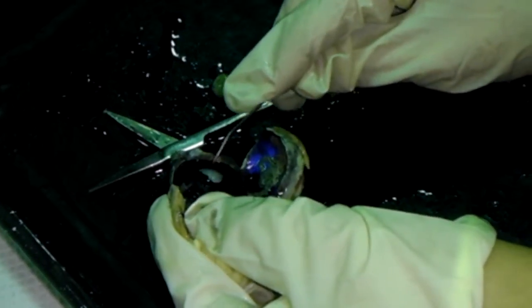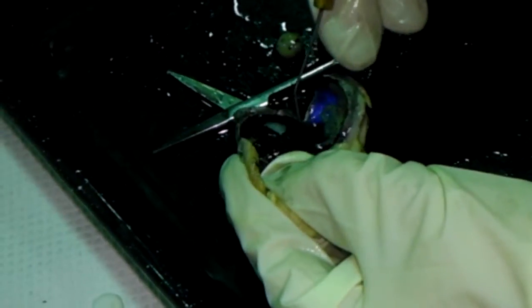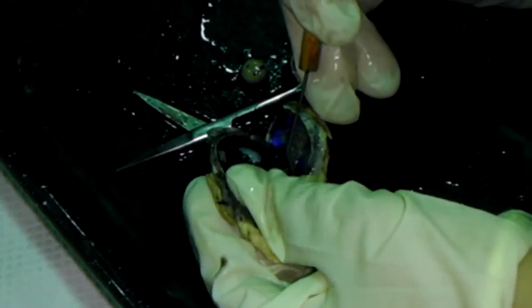And this is the opening that you have here inside. So this is the iris, guys. This opening is what? The muscles? No, the opening. Pupil. This is the pupil. So what you have just around it is the iris. If I put the pointer somewhere here, next to the opening, I mean the iris. Around the iris, the other dark thing, which is a little bit different if you look carefully, are the ciliary muscles. These are the ciliary muscles, right? Which are responsible for changing the shape. So this is the pupil, this is the iris, and these are the ciliary muscles.